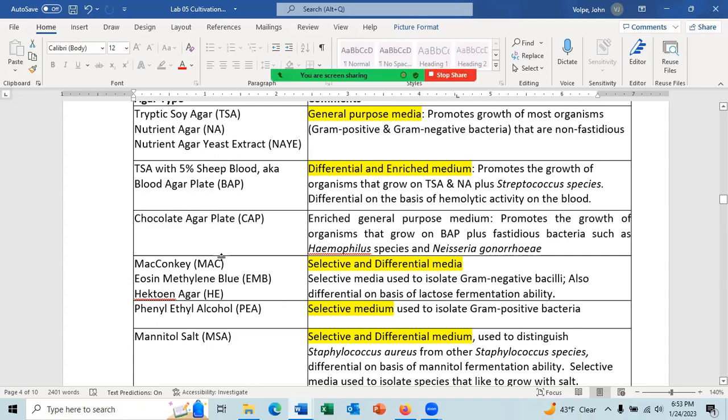And the color is generally the regular color, off-white, if they do not ferment the sugar lactose. But if you use a bacteria that has a pigment, like one that's red pigmented, if it does not ferment the sugar lactose, it will be its reddish color on whichever plate you grow it on.